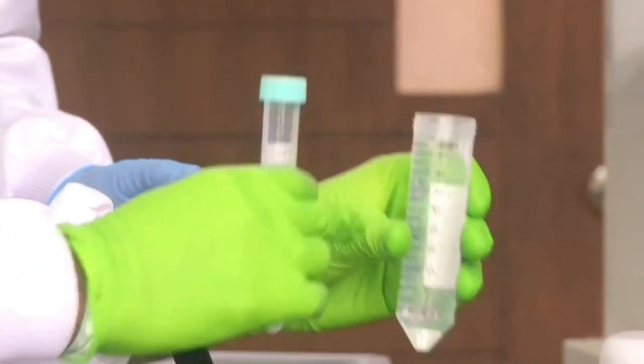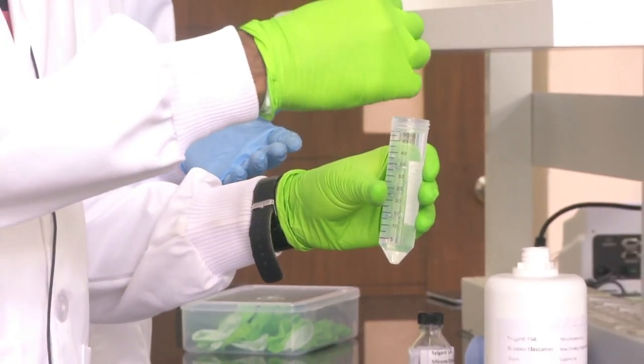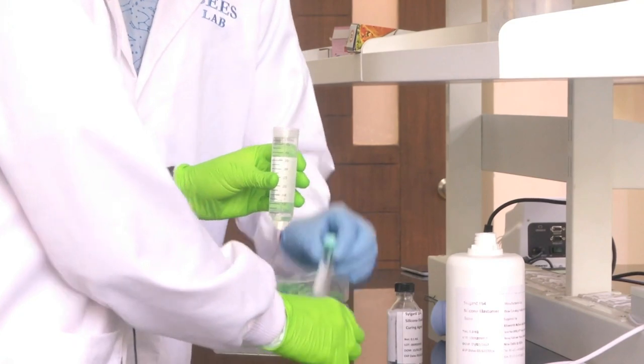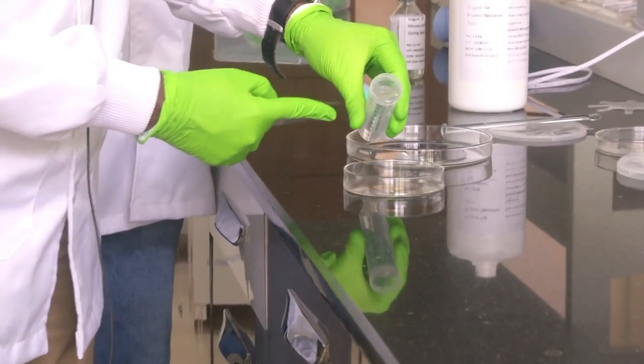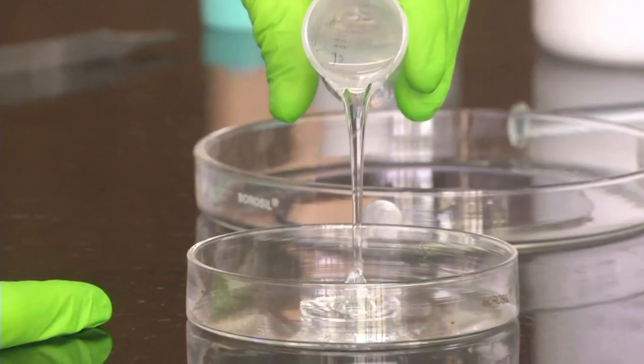We have taken 50 ml of PDMS and 5 ml of curing agent. Now we will mix it. First let me add the PDMS - if you observe closely, you will see that it is a very viscous chemical. It is basically another form of silicon.